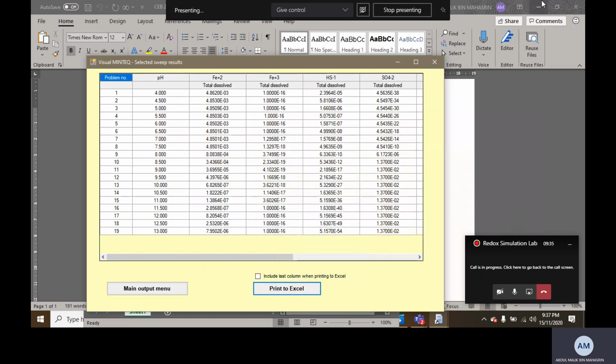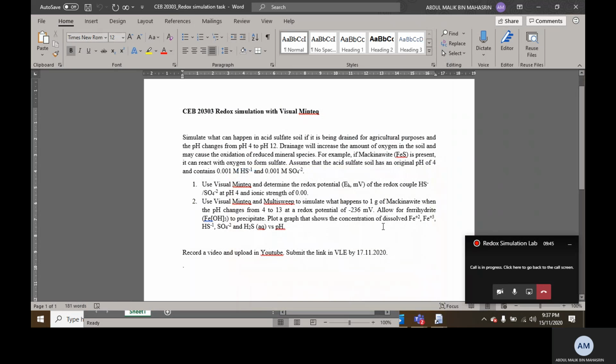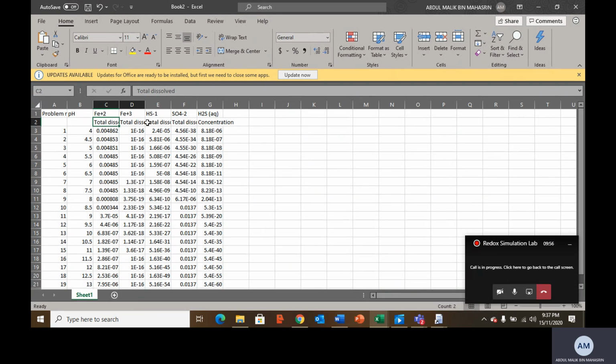It shall take a while. We move it here. This we put it down, and this will bring.